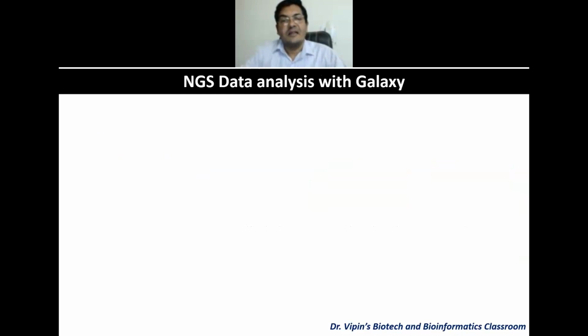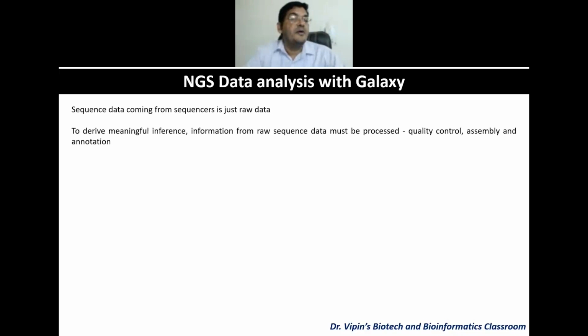All right, so now we come to Galaxy, right? Now the idea is, why do we need Galaxy? First, sequence data that comes from sequencers is just raw data. It may not hold any meaning unless it is processed. Therefore, you need formatting and then quality check and then alignment and everything to finally find meaningful inference from the data. So you need tools like Galaxy or command line tools like the ones we can use with Linux systems. To derive meaningful information, raw sequence data must be processed: quality control, assembly, and annotation.